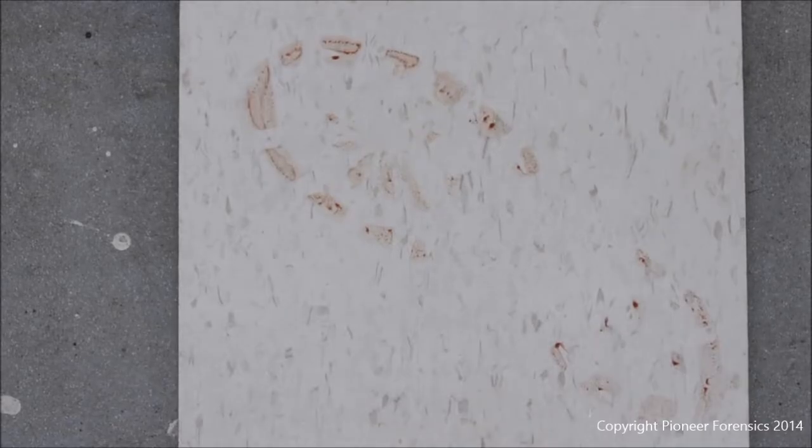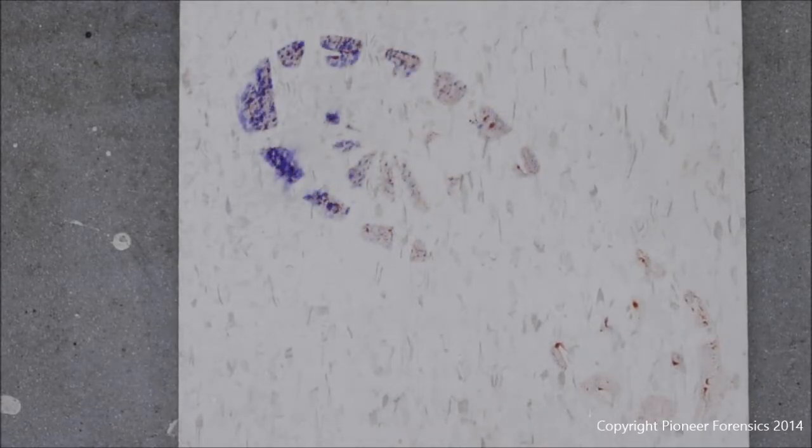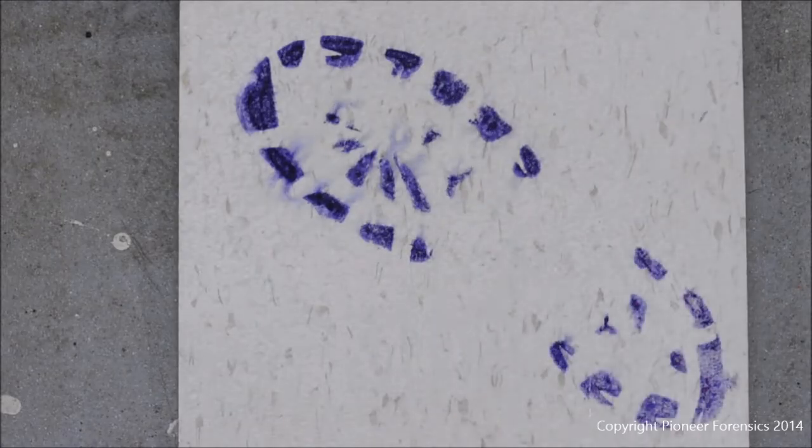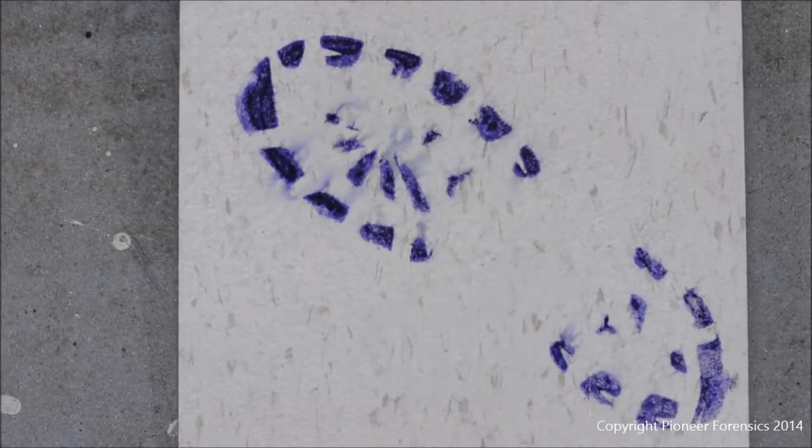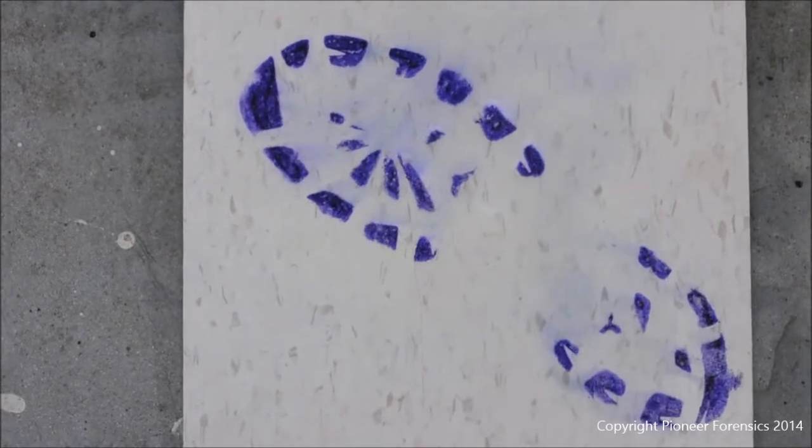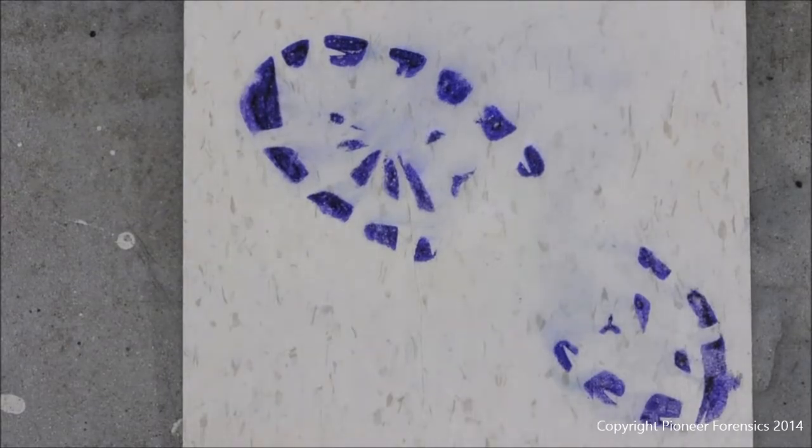It's useful in developing any latent bloody impression, meaning that if the impression is difficult to see or visualize, the application of LCV provides very high contrast, being a purple stain with anything that has blood present on that surface.